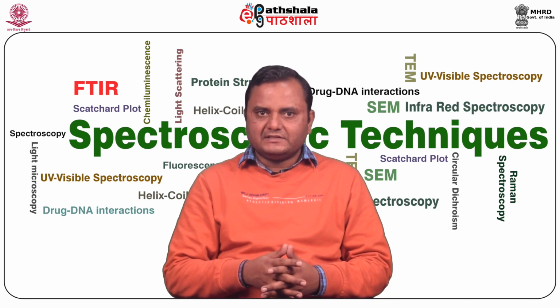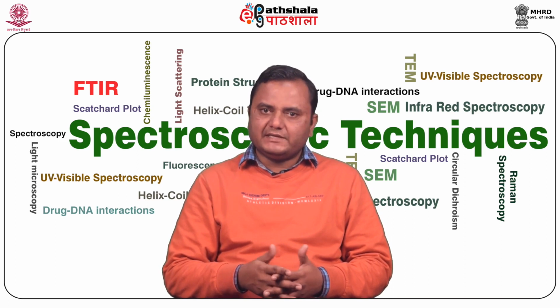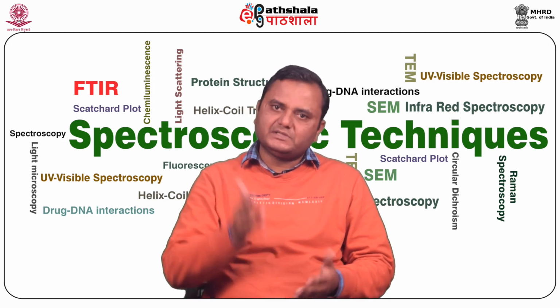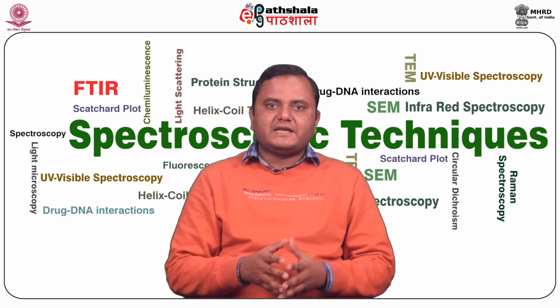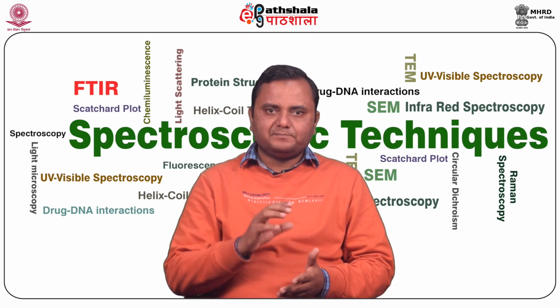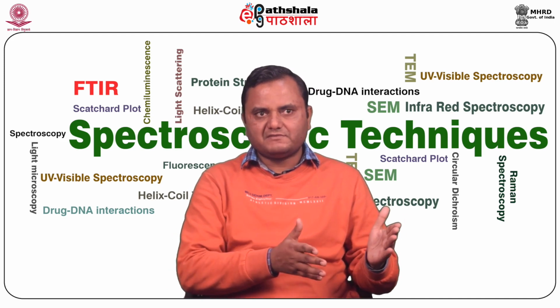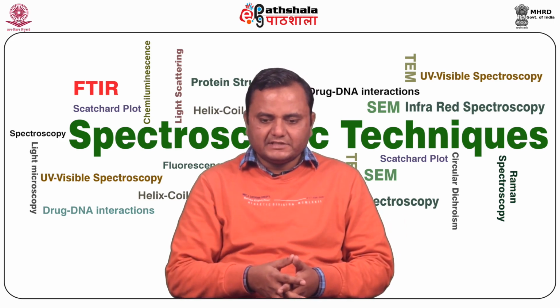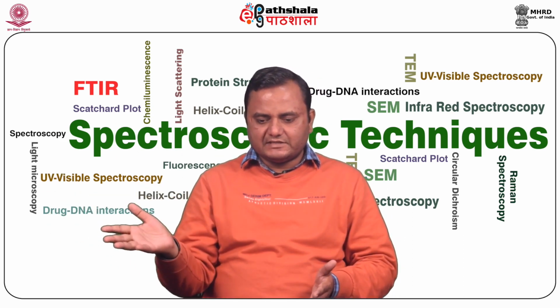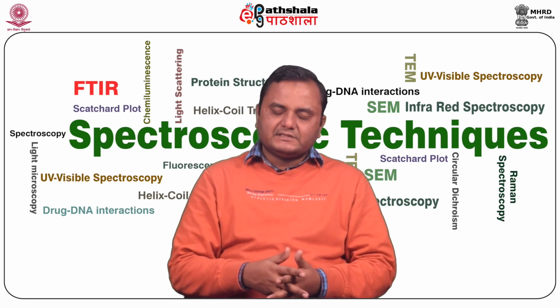The lamp source is a xenon arc lamp that emits radiation in the UV, visible and near IR region, which has a sufficient amount of energy to excite the electron from its ground state to the excited state. And the light is directed by an optical system through the excitation monochromator, which allows either pre-selection of wavelength or scanning a certain wavelength range. Once you know the absorption wavelength, you can directly select the absorption or excitation wavelength, and then you can collect the emission spectrum, and vice versa. You can fix the emission wavelength, and then you can scan the absorption wavelength.